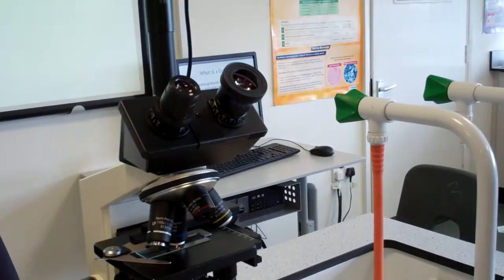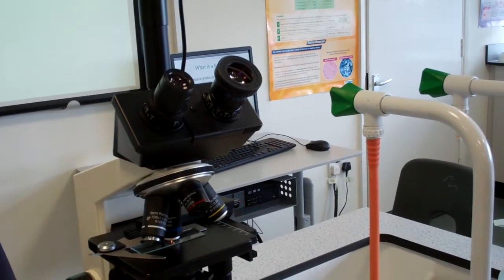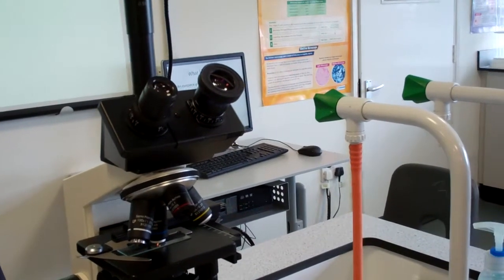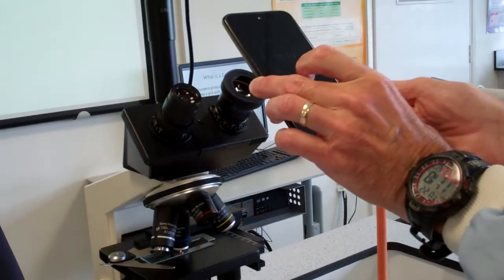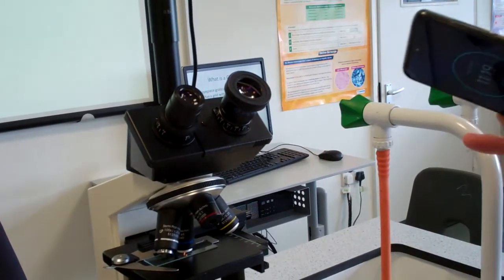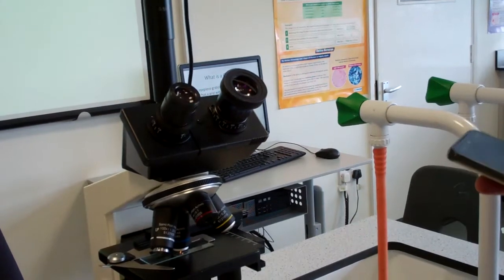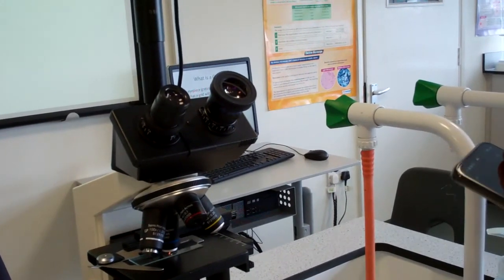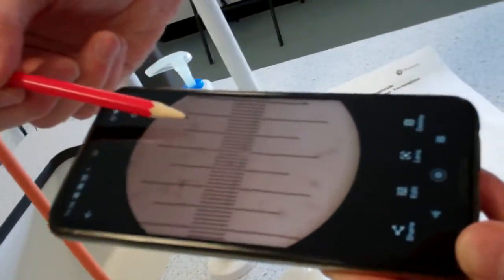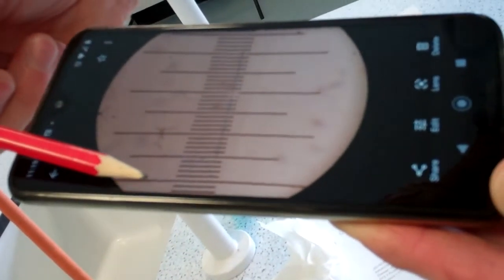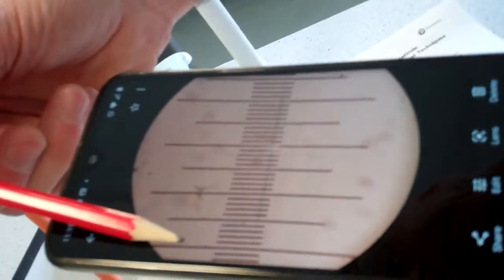If I show you what I've done, smartphones are a really good tool for taking photographs if you've got a good camera on your phone. What I've got here - this is the stage micrometer. Each one of these is 10 micrometers.